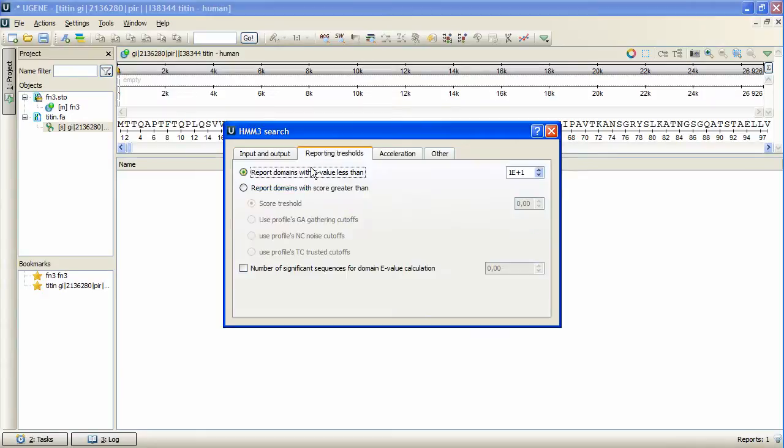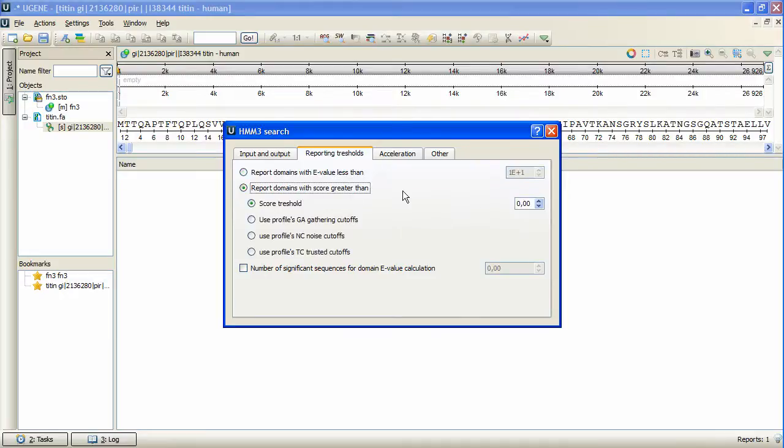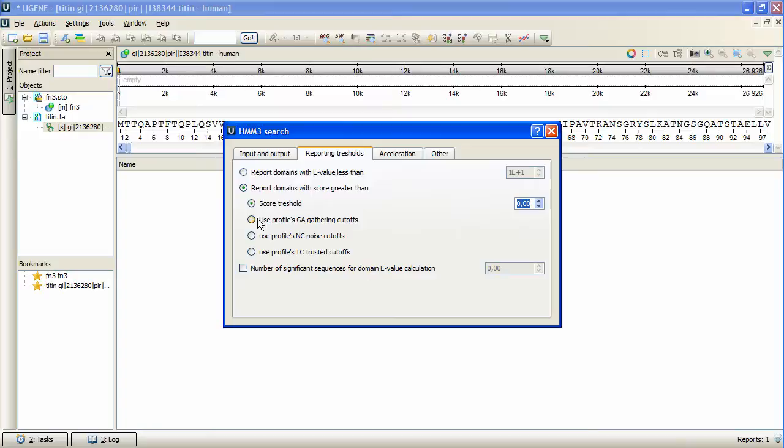The Reporting Thresholds tab contains the filter options. We can search for the domains with E-value less than the specified number, or for the domains with score greater than the specified number. Also it is possible to search for domains with score greater than the specified profile's cutoffs parameter value.